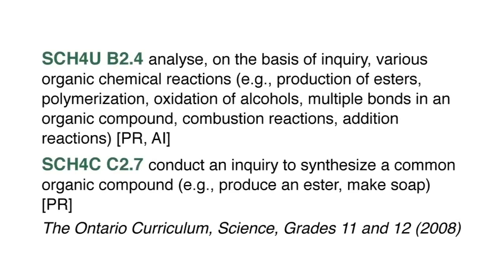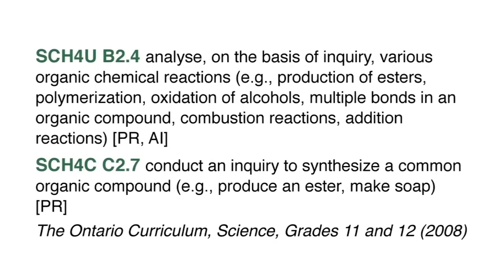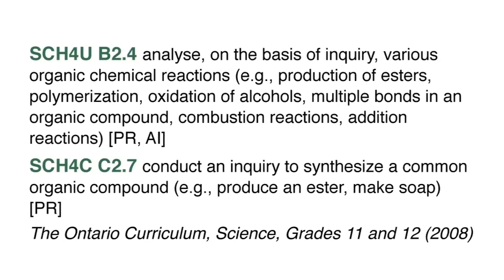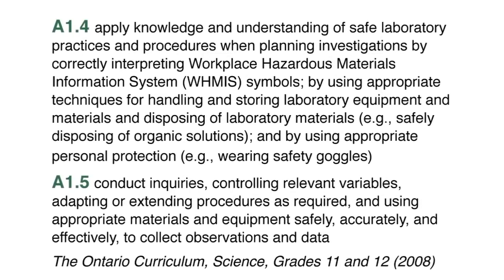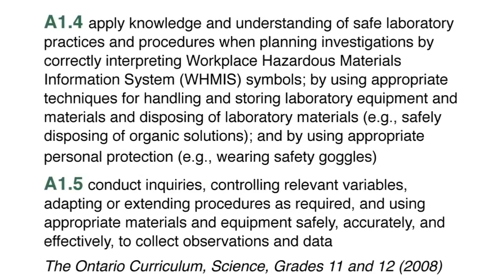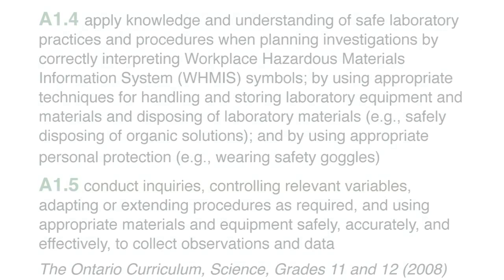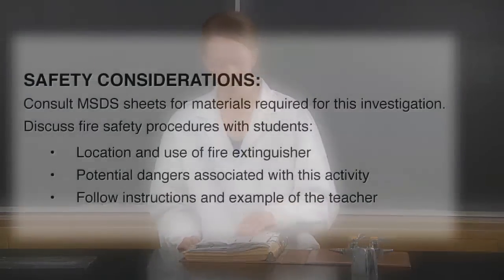This lab is one option to fulfill the requirements of Curriculum Expectation SCH4U B2.4 as well as SCH4C C2.7 and the Scientific Investigation Skills A1.4, A1.5. Teachers should consult the relevant MSDS sheets before considering this investigation.